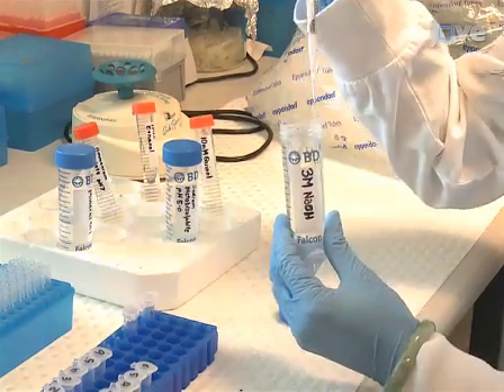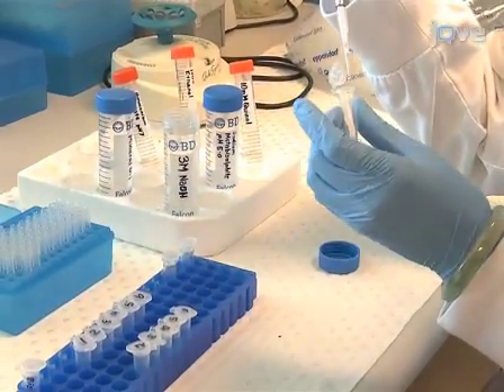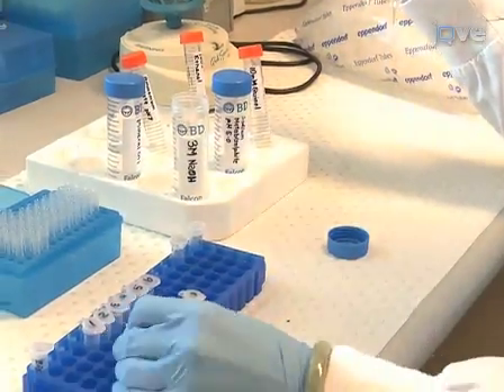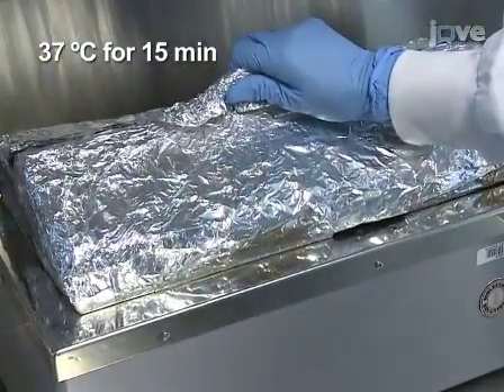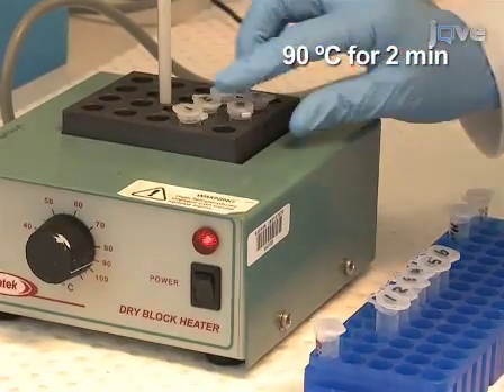Then denature the genomic DNA by adding 2 microliters of freshly prepared 3 molar sodium hydroxide to a final concentration of 0.3 molar. Incubate the samples at 37 degrees Celsius for 15 minutes in a water bath, followed by incubation at 90 degrees Celsius for 2 minutes in a heat block.